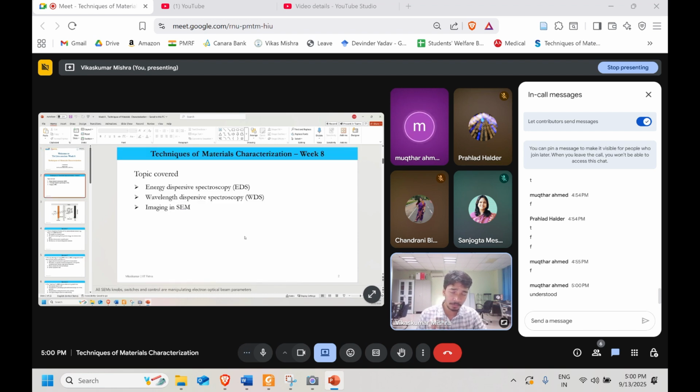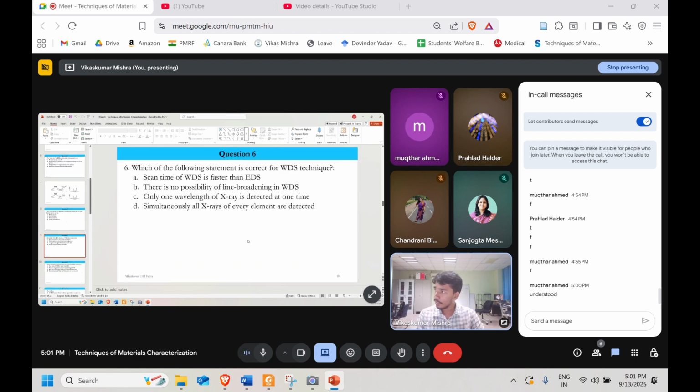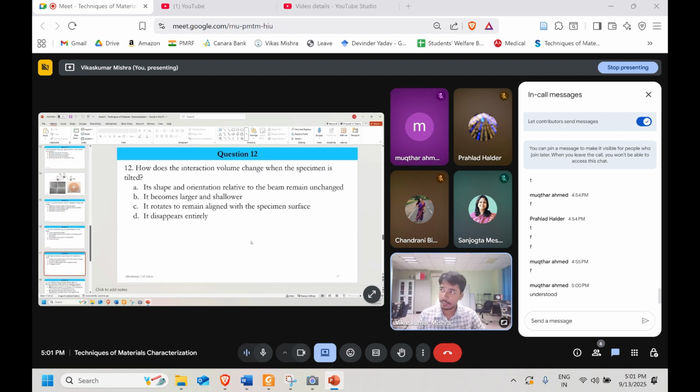So that is when tilting, both yields are increasing. But at a particular angle we prefer one type of electron, for example secondary electrons compared to backscatter. So at that time, what do we need to do? That's the question. For that tilting part, we need to find the particular angle you want. Is there any particularly efficient angle at which it is better? Yeah. So these are the two things. I'll prepare the slides accordingly.